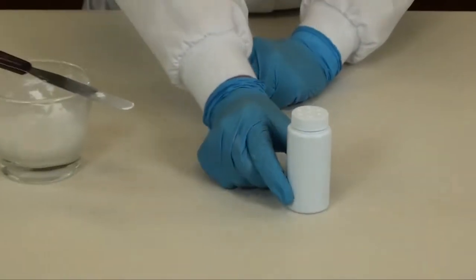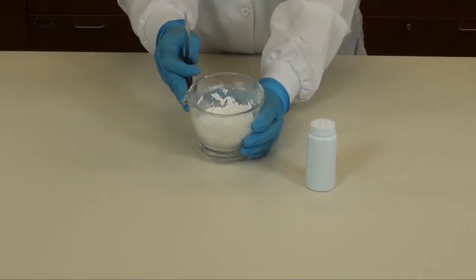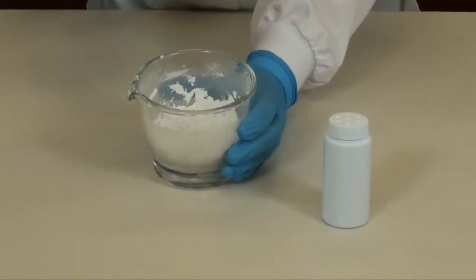Your product is now ready to be dispensed. However, we still have some excess powder. Please dispose of this appropriately.